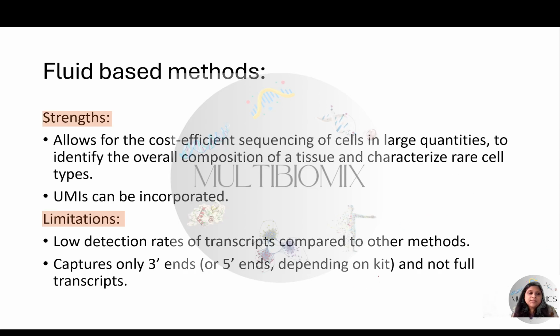So there are some strengths and limitations of the fluid-based method. The first one is that it is cost efficient. And then cells in larger quantities can be studied and identified, and we can also characterize the rare cell types.